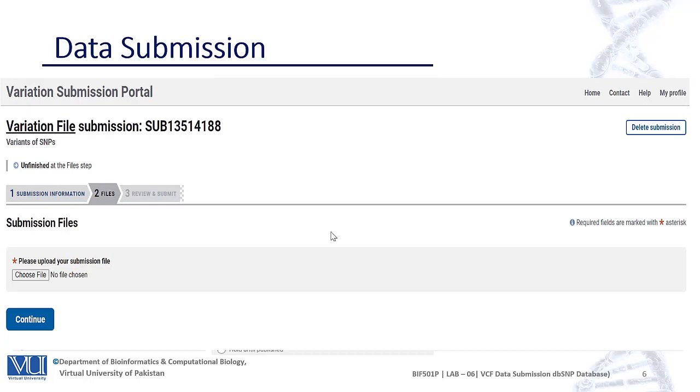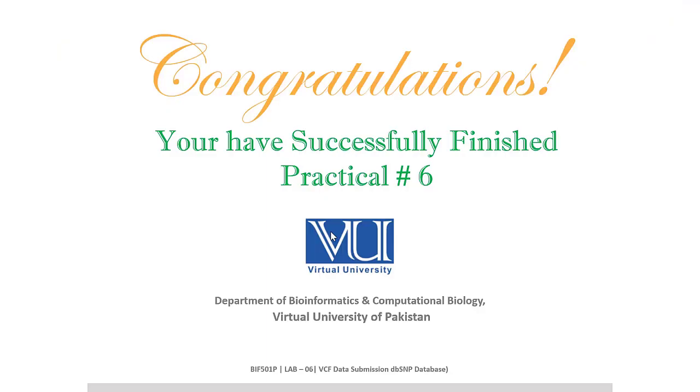It's important to consult the specific guidelines and documentation provided by the NCBI database you are submitting to, as the submission process may have some variations depending on the database requirements. Dear students, we have successfully finished practical number 6 of this course.